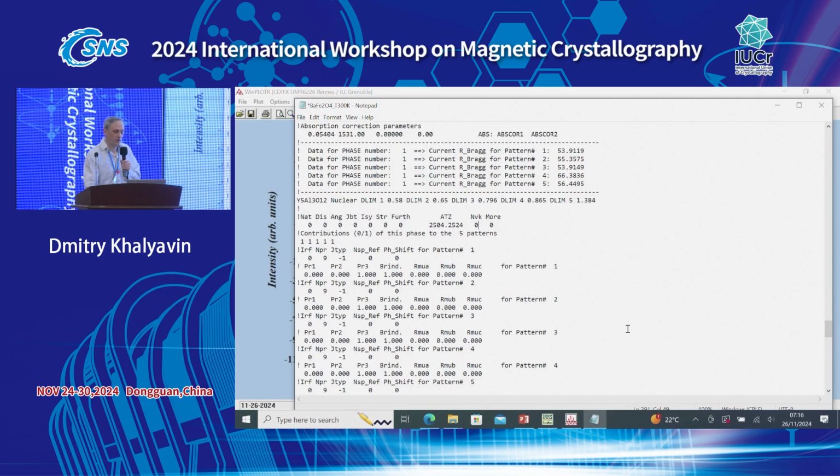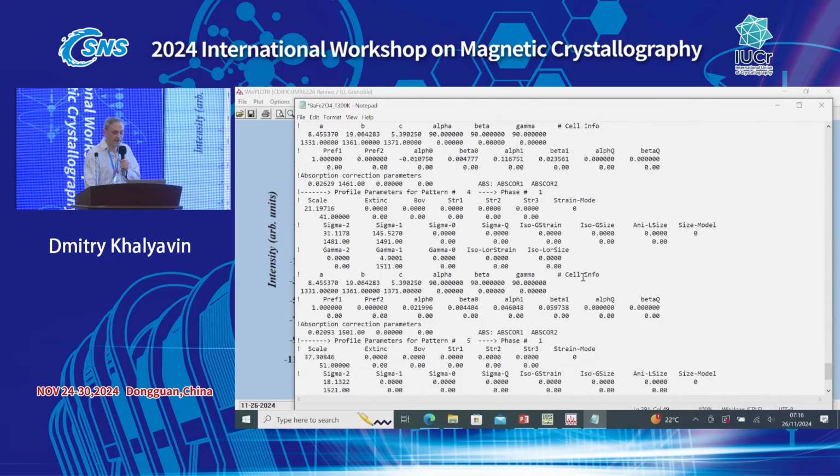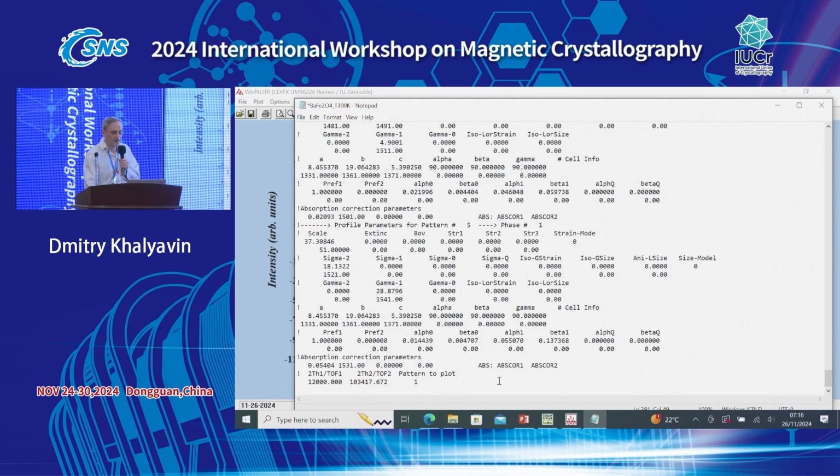And now we can put in our propagation vector. It will be a special point. So k minus k equivalent, positive number, 1. And then at the very end of our PCR file, we can specify our propagation vector: 3 components of the propagation vector, and 3 flags, because in the general case we can vary components of the propagation vector.